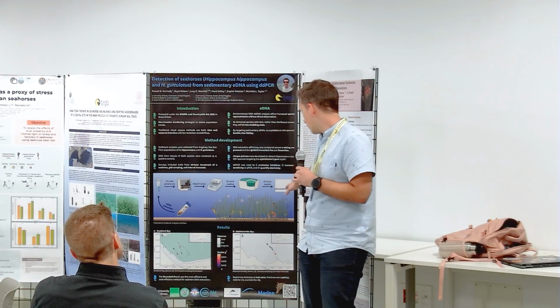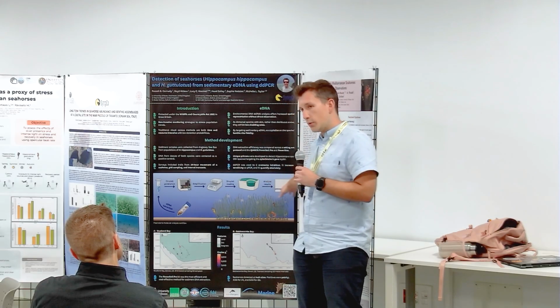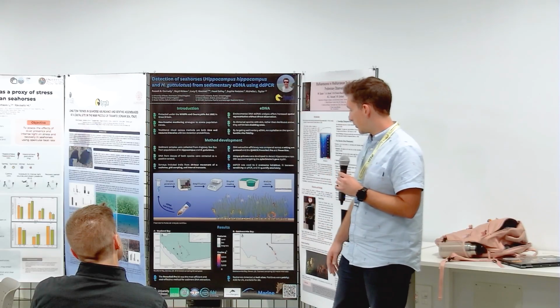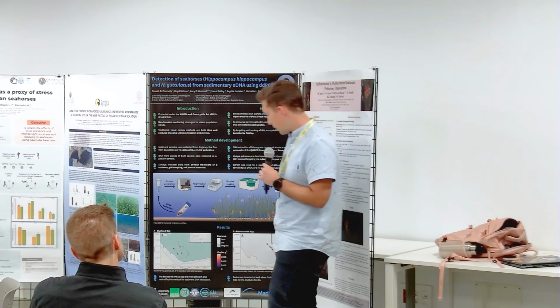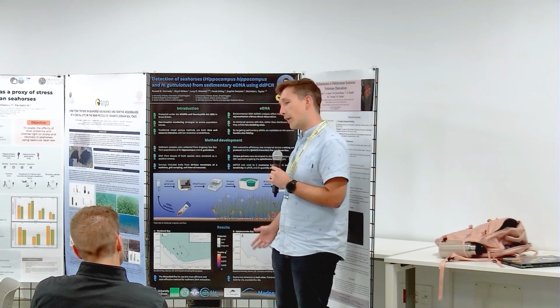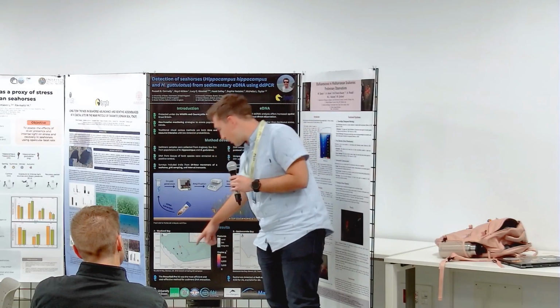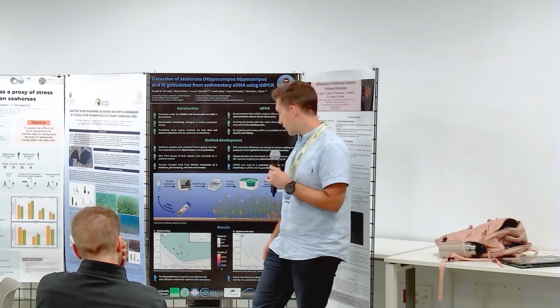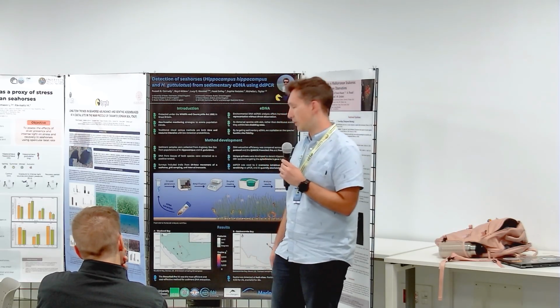This is an actual result from the digital droplet PCR machine. Anything above this cloud is positive seahorse. And so we can move that on to testing in situ. We went down to Studland Bay, where Hippocampus and guttulatus are found in the area of South England, and we sampled systematically throughout a region, and we found 4 positive samples out of the lot. So we're getting very, very high site specificity for seahorses within that area.